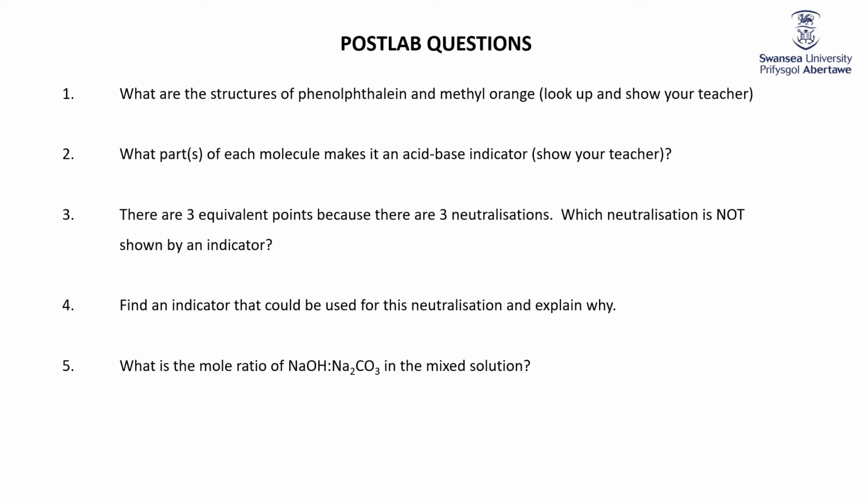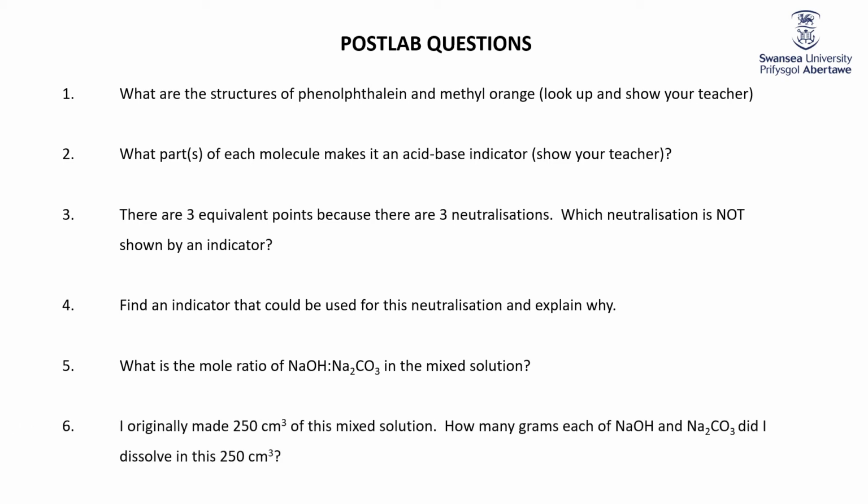So you can use the titration data to get the moles of sodium hydroxide and the sodium carbonate. What's the mole ratio of them? And then finally, I originally made 250 cubic centimeters of the mixed solution. So I took a certain number of grams of sodium hydroxide and a certain number of grams of sodium carbonate, dissolved it up and made it up to 250 cubic centimeters. You have the information available to you to be able to calculate how many grams of each of these I used.